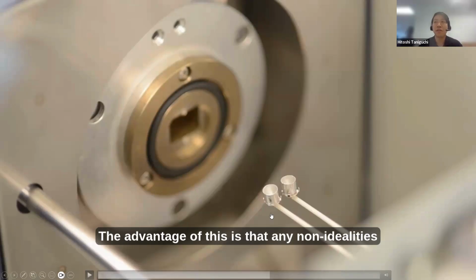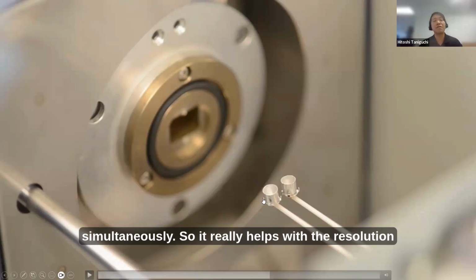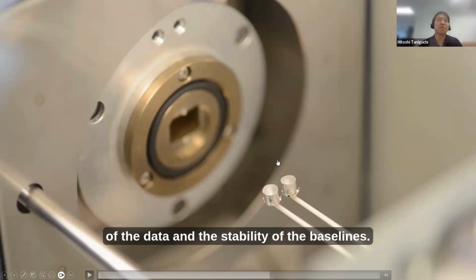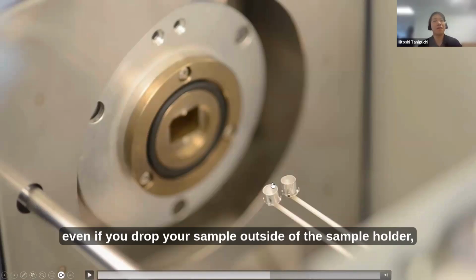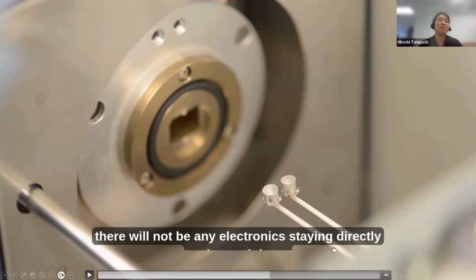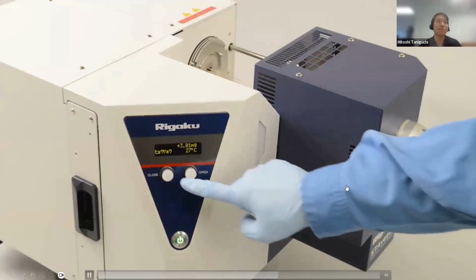The advantage of this is that any non-idealities present in the system will be canceled out by having this reference side measured simultaneously. It really helps with the resolution of the data and the stability of the baselines, as well as practical advantages: with a horizontal STA, even if you drop your sample outside of the sample holder, there will not be any electronics directly underneath, so you can just recover it by picking it up.